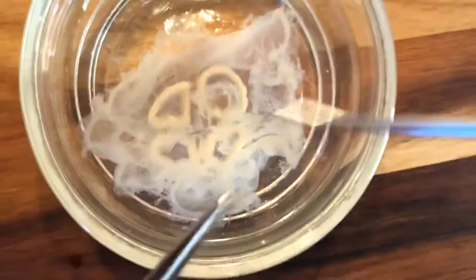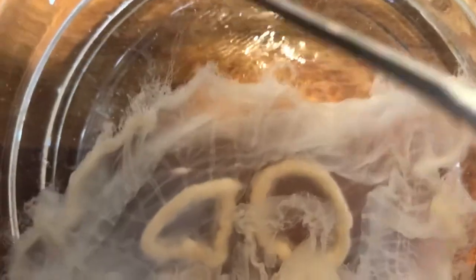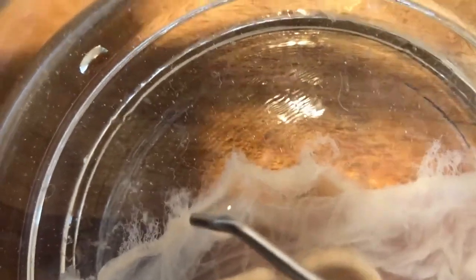Nidocytes are a little bit too small to actually see because they are individual cells. But the nidocytes themselves would be located along the margin of the umbrella, on these little stringy structures. The nidocytes are what actually discharge when a jellyfish is stinging its prey.